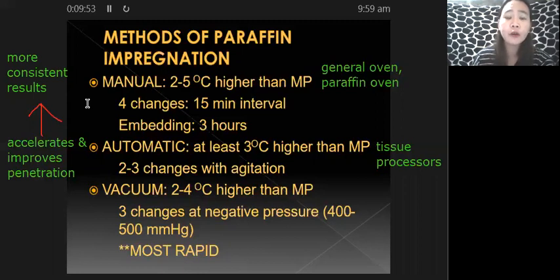What we want is to remove the subjectivity, however it would still be there. It's unavoidable, especially if we perform manual procedures. For example, some personnel would have better skills as compared to others.